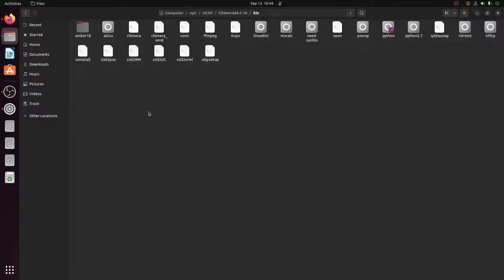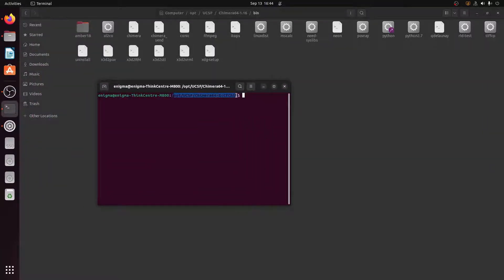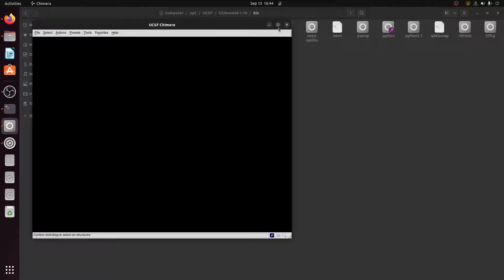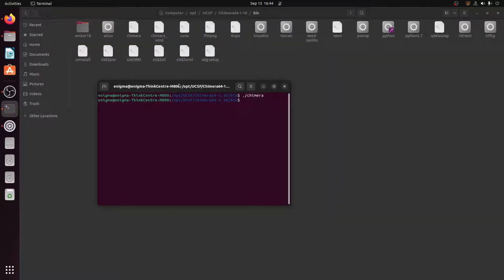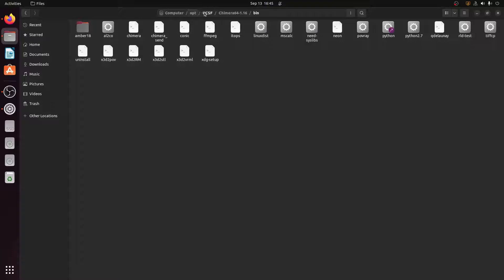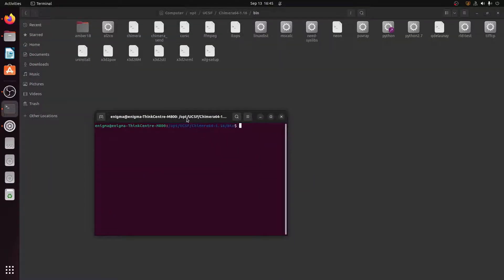This is basically the place where Chimera is installed. You can also open Chimera like this: just open a terminal in this folder by right-clicking on the empty space and clicking 'Open in Terminal'. From there you can type './chimera' and it will open. But if you want to open Chimera without navigating to this path every time, you can do it by creating an alias. First, we will identify the location — the address of the place where Chimera is installed. We will open the terminal inside this folder and type the command 'pwd'.